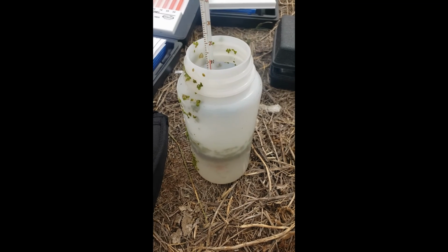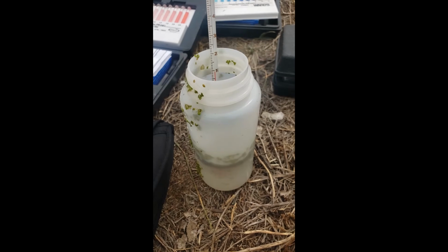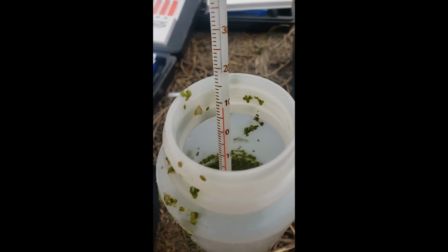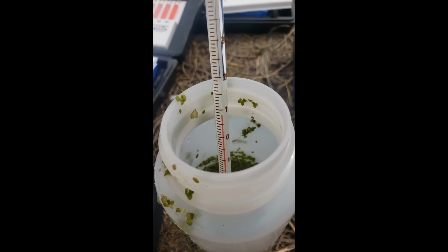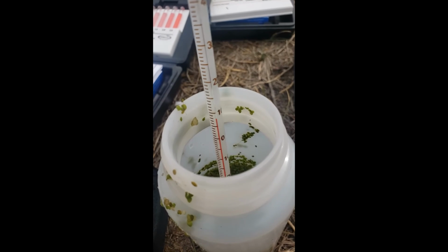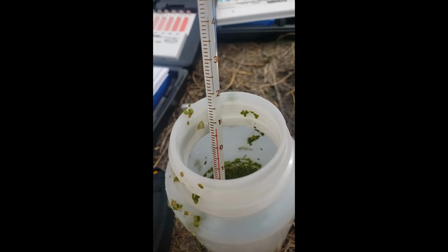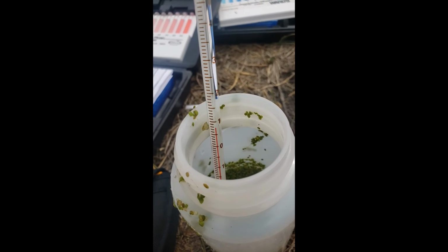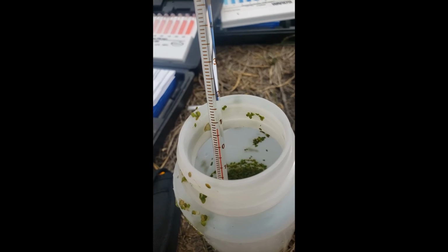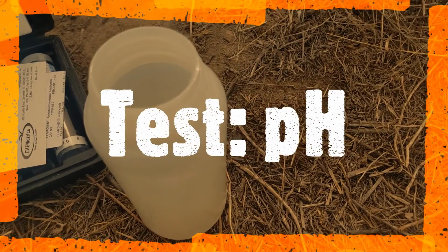Measuring for my pond sample, and ooh, wow, pretty interesting. Let's see, it's getting cooler. But not quite as cold as the river. Very interesting. So I would say we're at 8 degrees C. So now let's go ahead and measure the pH.